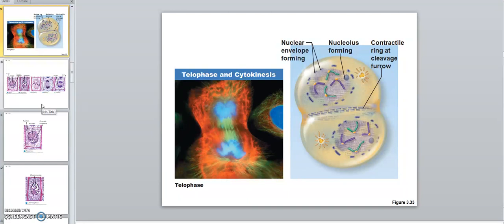So if you go back to the big mitosis PowerPoint on my website, you can see that. So what I'll do on the lab practical online is put 1 or 2 stages with no name on it, obviously, and then I'll say what stage of mitosis is this. So there it is. Okay.